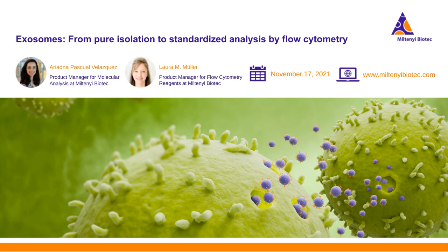Thank you very much. Do capture beads rely on tetraspanin expression only, or can they be customized to use other capture strategies?